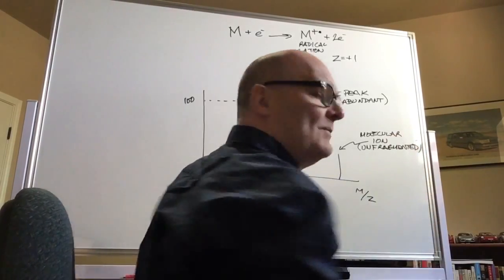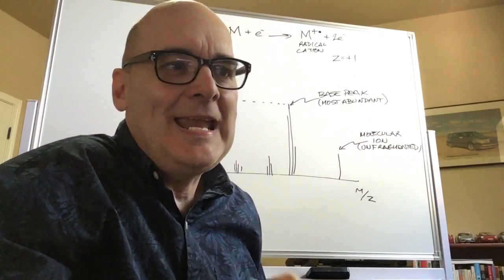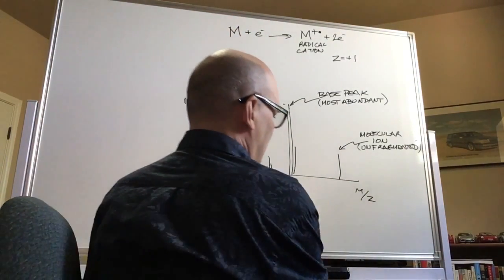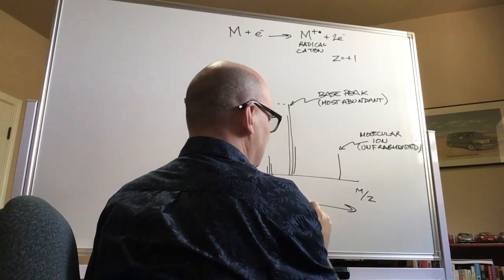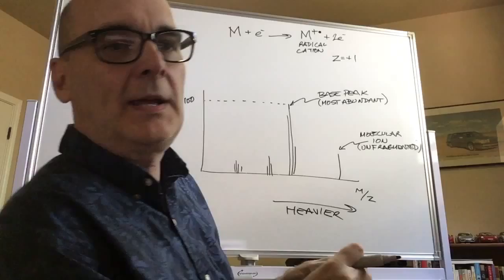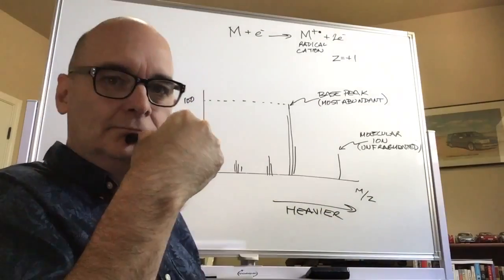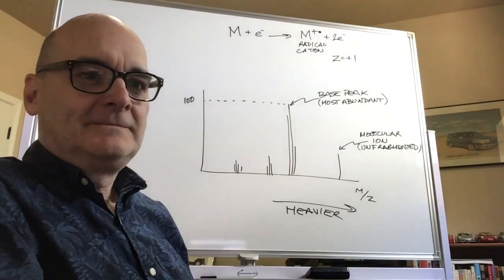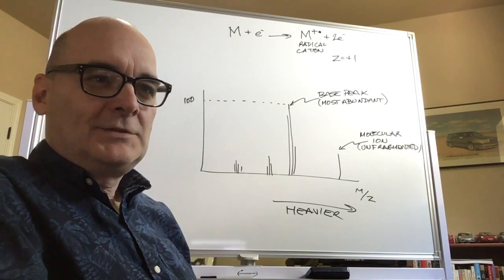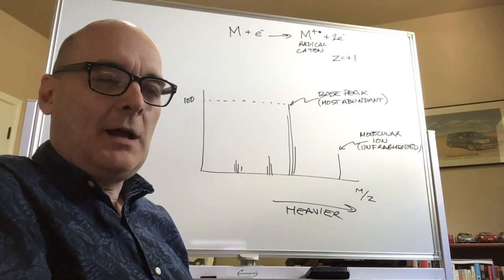All right. Here's a question. Can anything be heavier than the molecular ion?